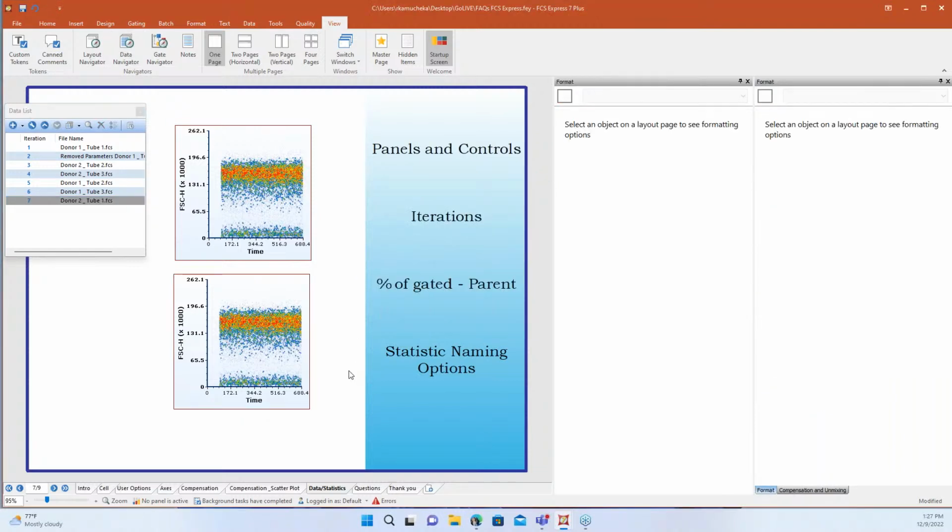Holly, what are the challenges that you've seen with iterations? Oh, I would say the same. Usually it winds up with, I see it more often, or I have people write into support when they're doing histograms rather than dot plots.